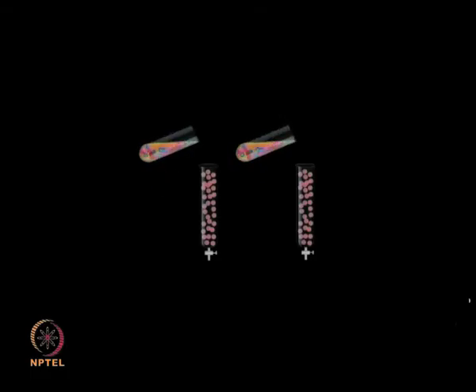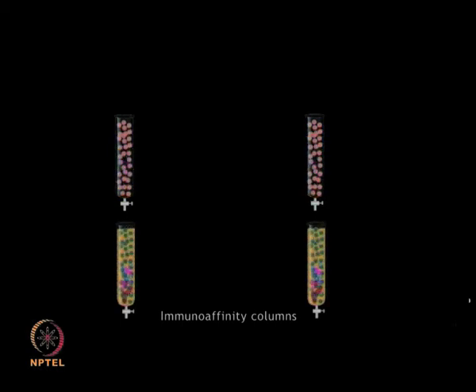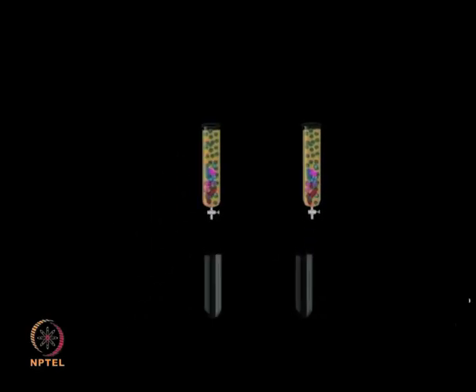So, serum samples of control and cancer patients were first of all depleted by using a multiple affinity removal system to carry out immunodepletion of the serum samples from normal controls and ovarian cancer samples.